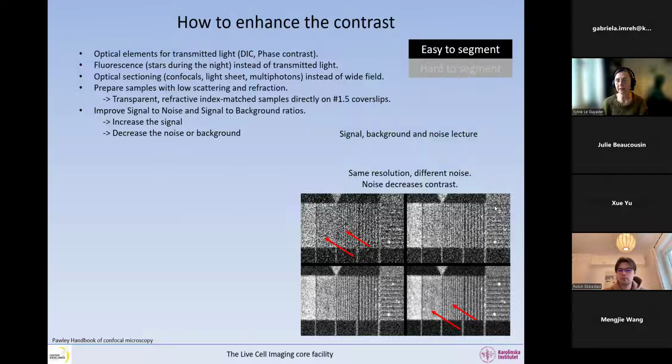So you can see in this image of a grid, again, this is the way to measure the performance of a lens, be it for microscopy or for photography. There is a high noise in this image. But these lines are anyway imaged, so there is anyway a high resolution, but because of the noise, the resolution is hidden.